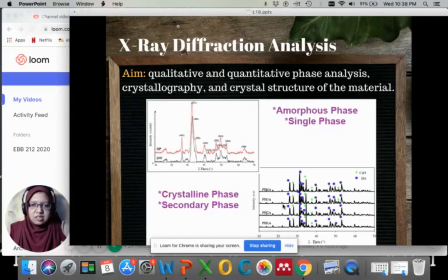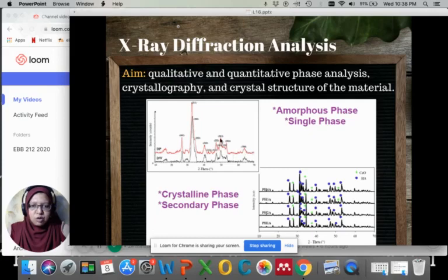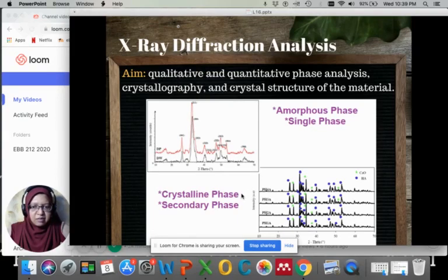As you can see here, there are different diffraction patterns. The top one shows a single phase and amorphous phase diffraction peaks. It is single phase because they are all the same and there is no secondary phase detected. The amorphous phase is shown by the broad peaks, as compared to the sharp and narrow peaks which indicate that the samples are in crystalline phase.